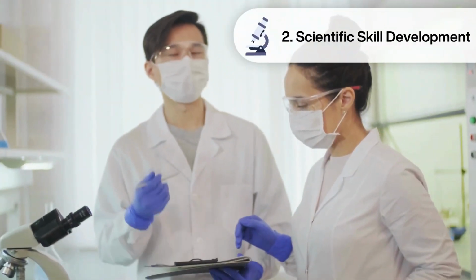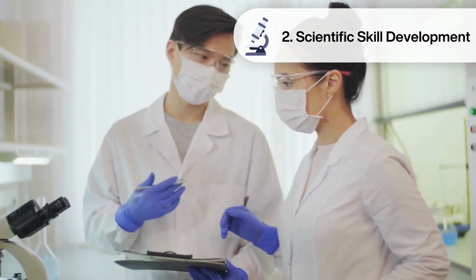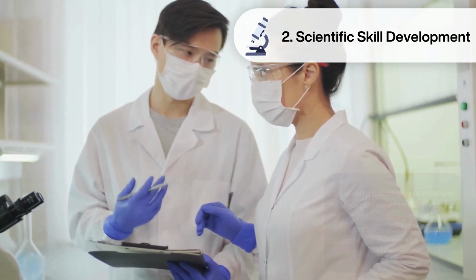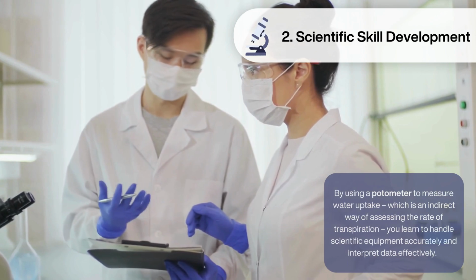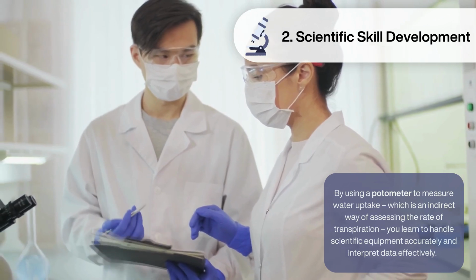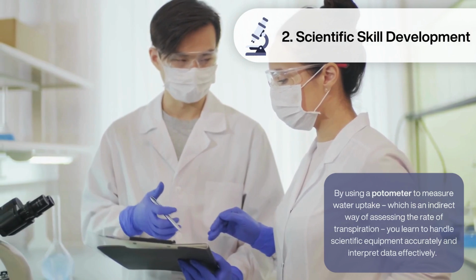Secondly, this practical offers you the opportunity to refine essential scientific skills such as precise measurement, data collection, and analysis. By using a potometer to measure water uptake, which is an indirect way of assessing the rate of transpiration, you learn to handle scientific equipment accurately and interpret data effectively.